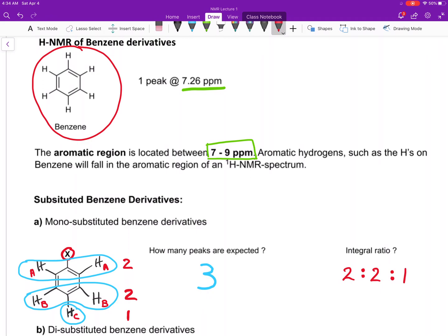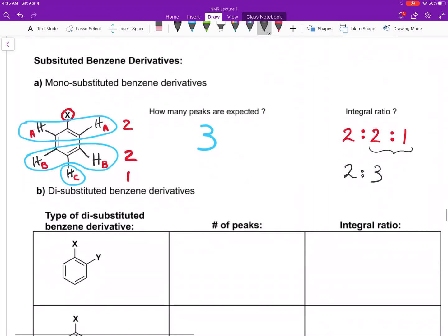In reality, it's not always as clean cut as it looks here. Often the two and the one will overlap, so the actual ratio you see on the spectrum may look like a two to three ratio instead of a two to two to one. Just giving you a little heads up on that. Moving on from monosubstituted benzene derivatives to disubstituted benzene derivatives, where you have two different substituents.